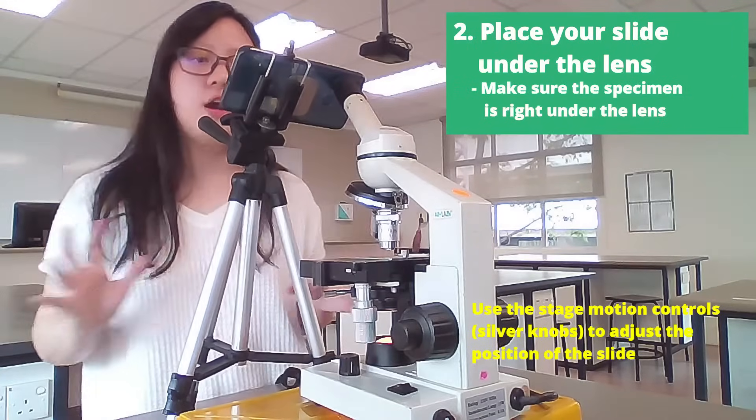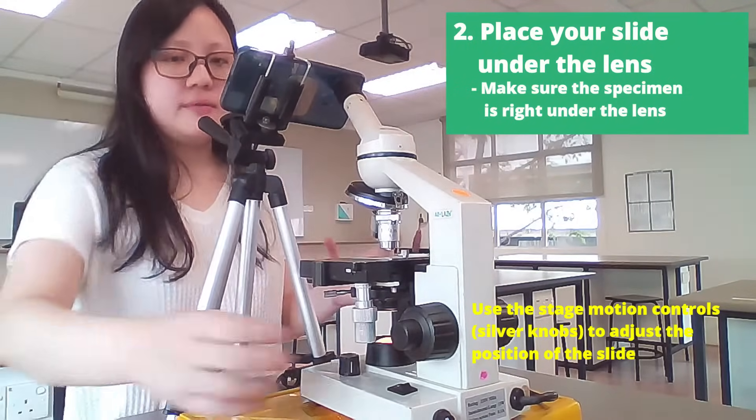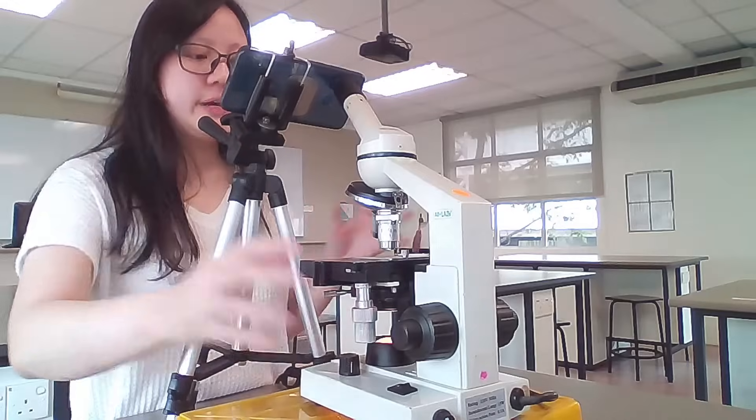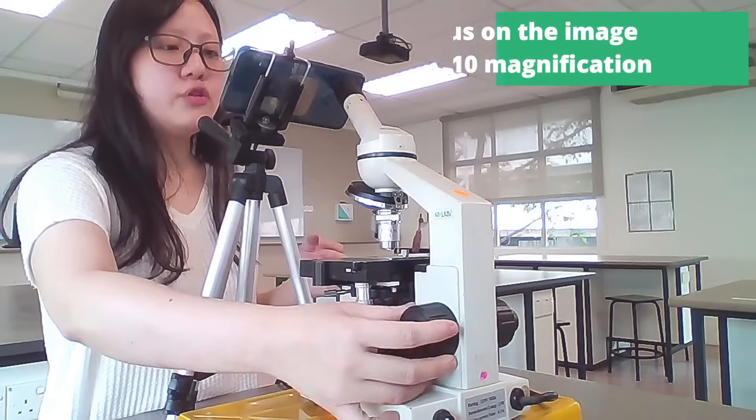You won't be able to see anything from the lens just yet, but we will focus on it later. Just make sure it's somewhat in the center. Now we can move on to focusing.